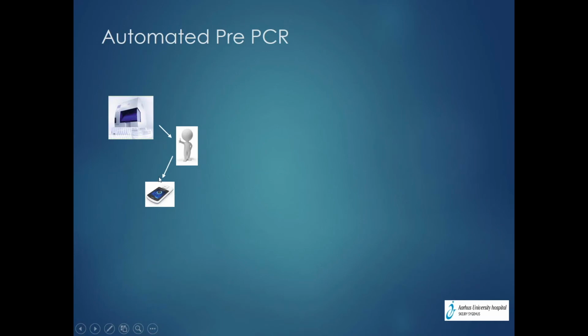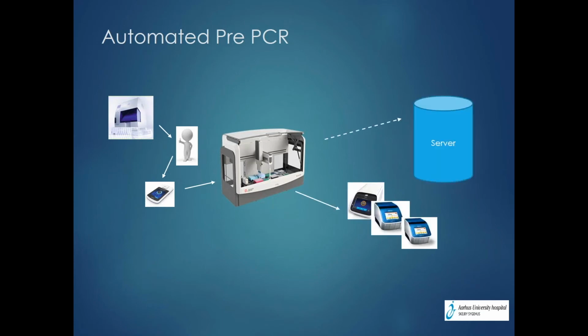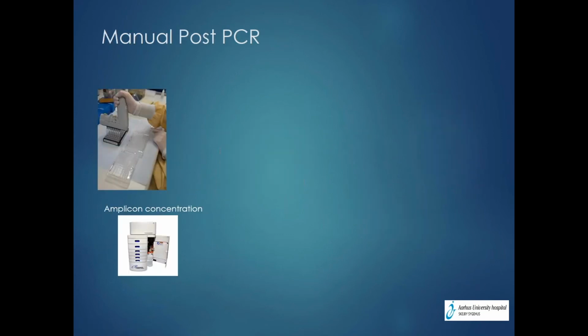So the technician does the quantification on the Qubit, but after that, the samples are put on the Biomek station, and on the Biomek station, we can scan the barcodes from the samples. We can tell the station what the concentration of the DNA samples is, and we can then get the station to pipette and do the normalization of the DNA samples in the way we want. After that, of course, the samples are amplified and the sample names are sent to the server.